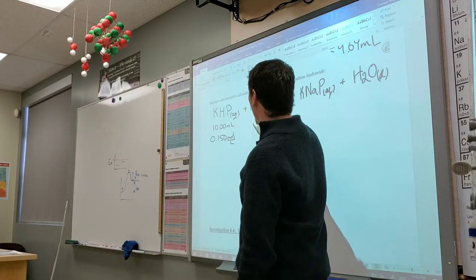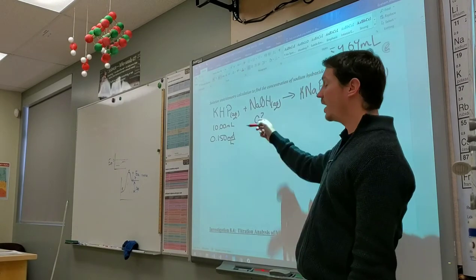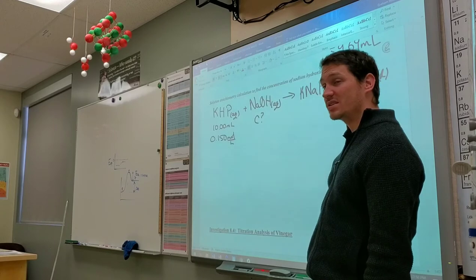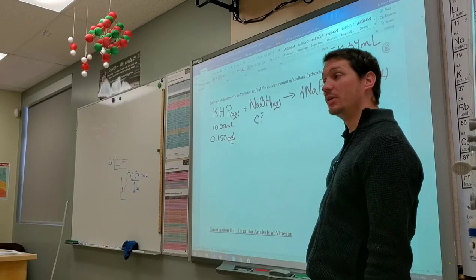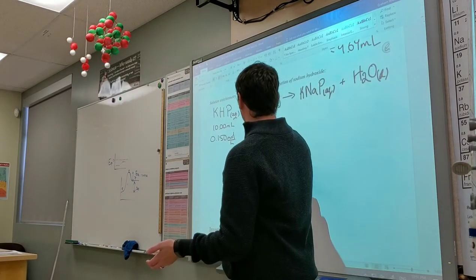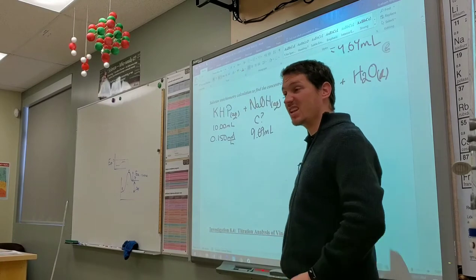Now, we want the concentration of sodium hydroxide. In order to do that, what else do we need? Do we know the volume of sodium hydroxide that was added? Yeah, we do. You just calculated it, didn't you? On average, it took 9.69 milliliters.